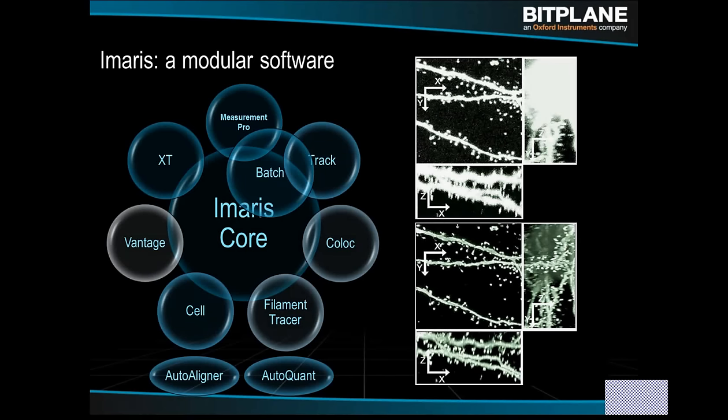And for those of you who aren't familiar, deconvolution software basically takes you from the top image down to the bottom, where we're removing, not necessarily removing, actually there are multiple options. Ideally what you want is to reassign some of the out of focus light back to its origin, the object that generated that out of focus light. And so essentially you get a bit better resolution even with images that are already confocal, particularly along the z-axis as is shown at the bottom here.